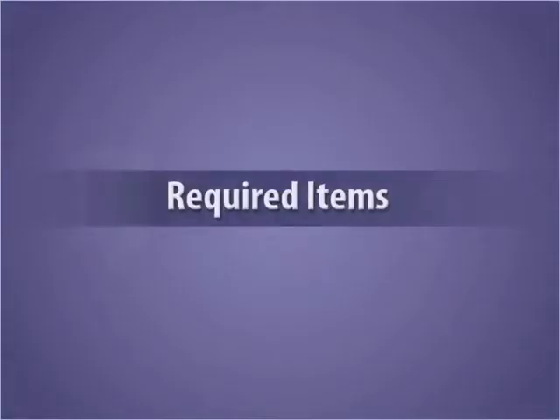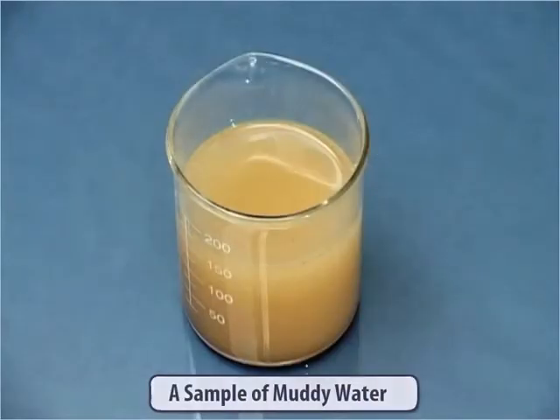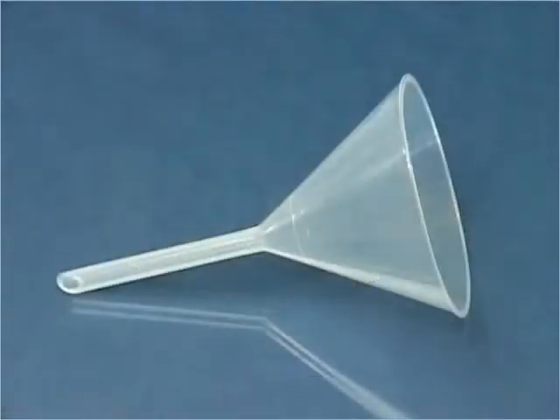For this activity, we need 2 beakers, a sample of muddy water, a tea strainer, a piece of cloth, funnel and filter paper.